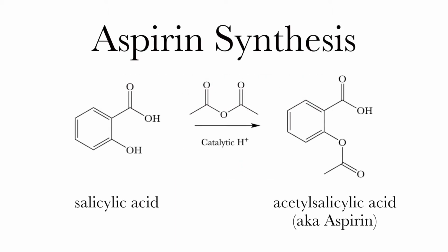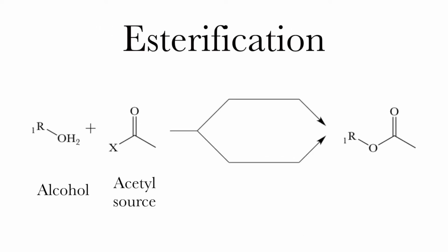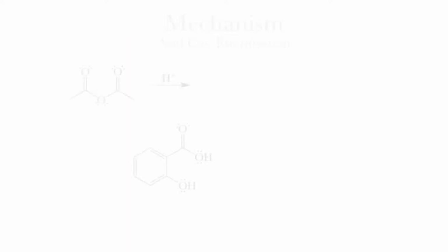Synthesis of aspirin. This is essentially an acid-catalyzed esterification. Now, esterifications, or the creation of an ester group, can either be done in acidic or basic solutions. Make sure if you look up the mechanism that you get the correct one, though I will show you the beginning of it.